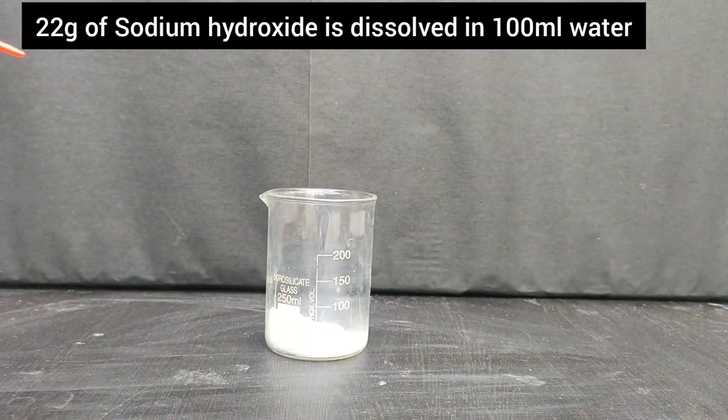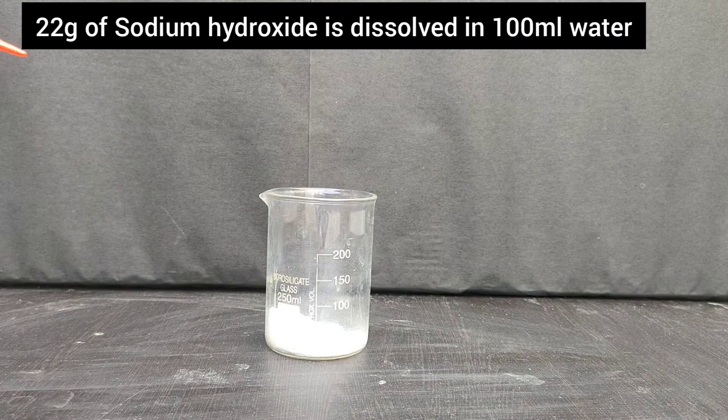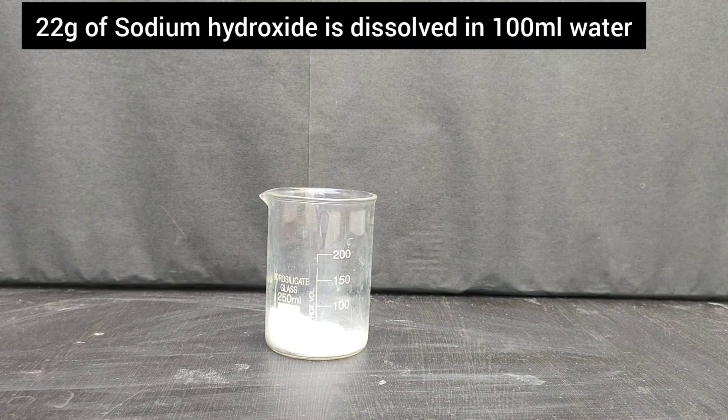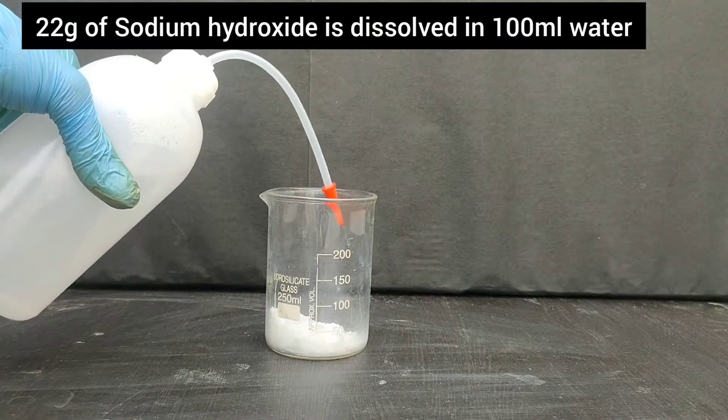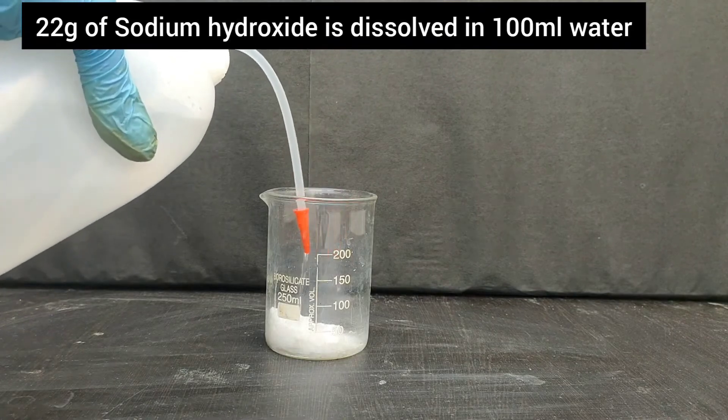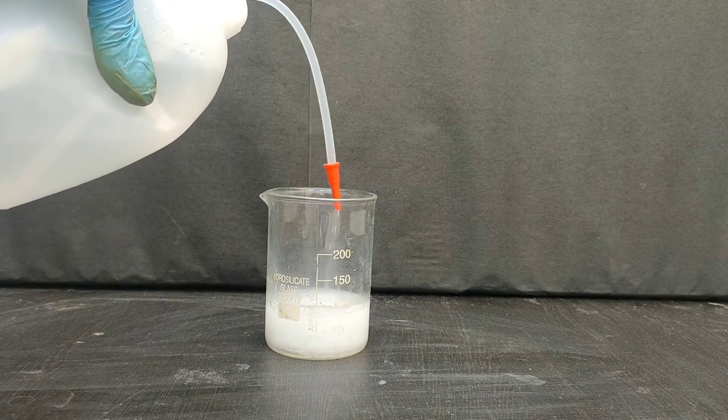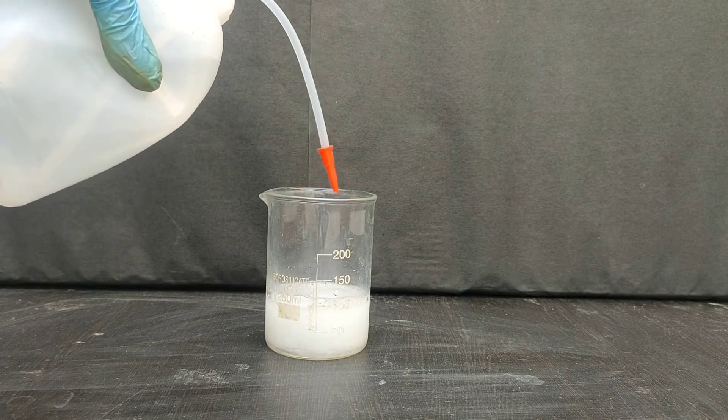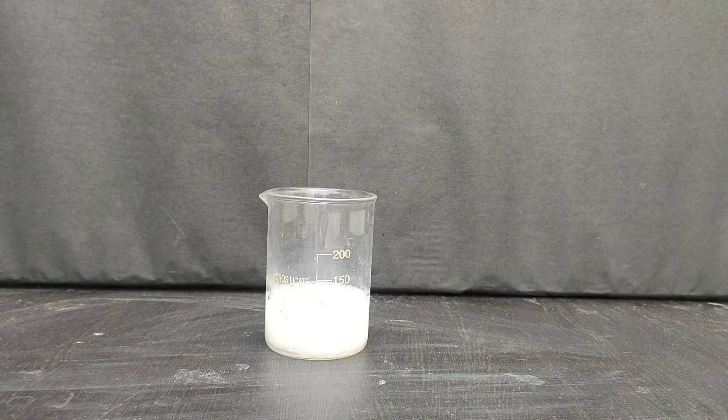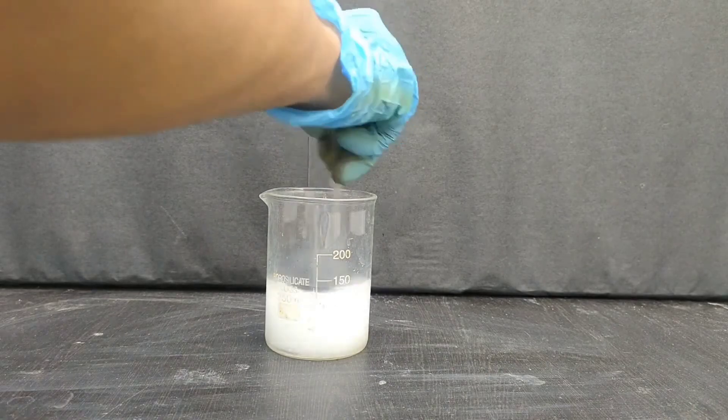We will take 22 grams of sodium hydroxide in a beaker, and to this, we will add 100 ml of distilled water and make a solution.